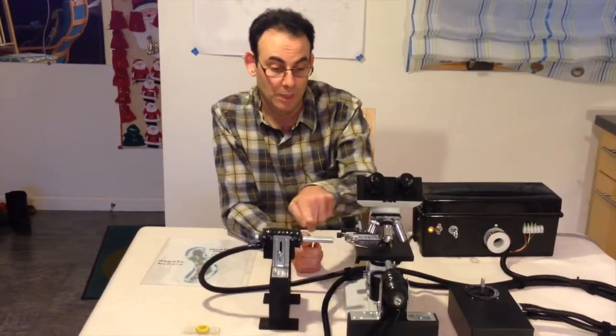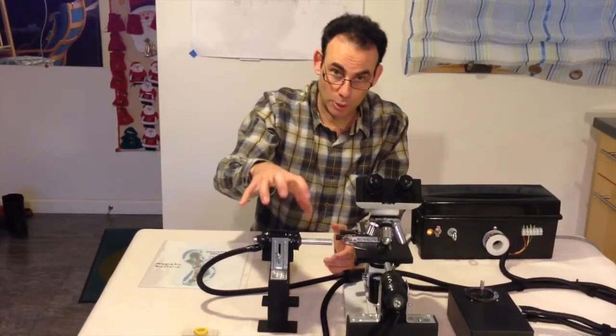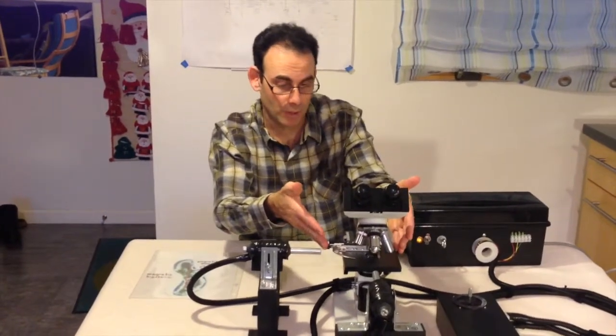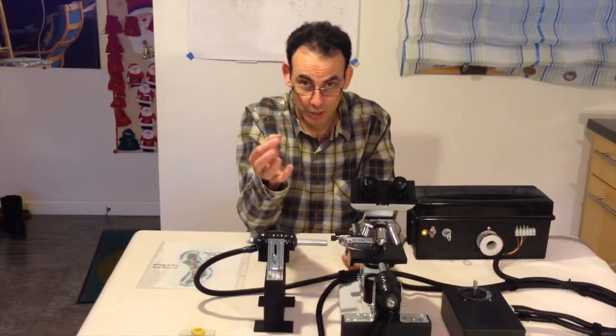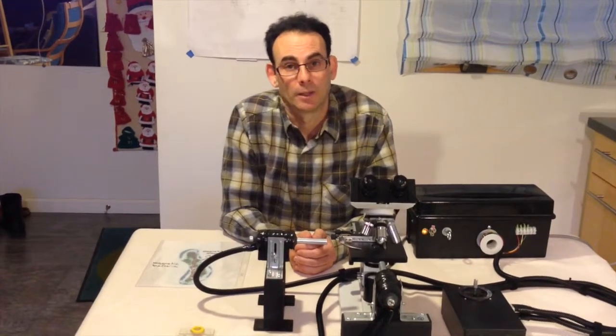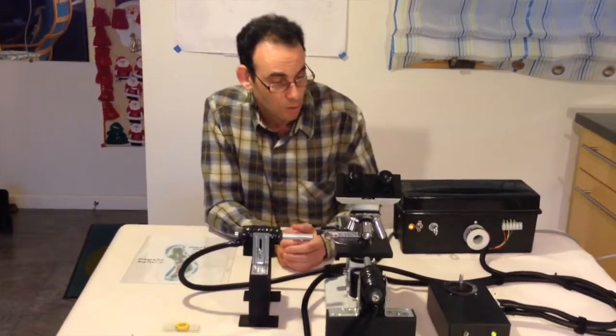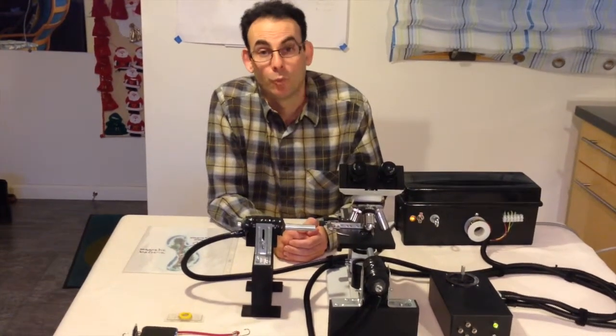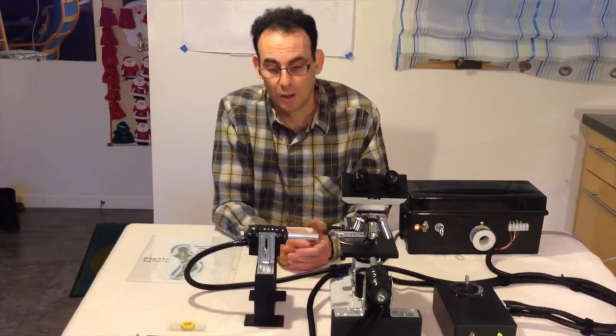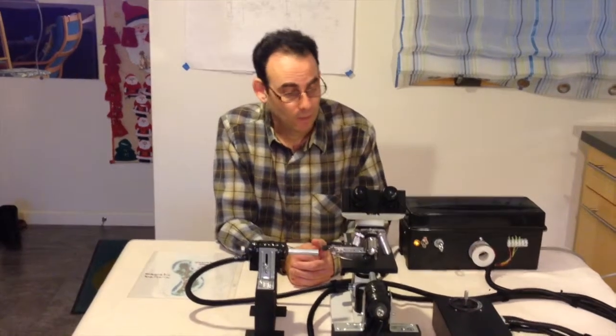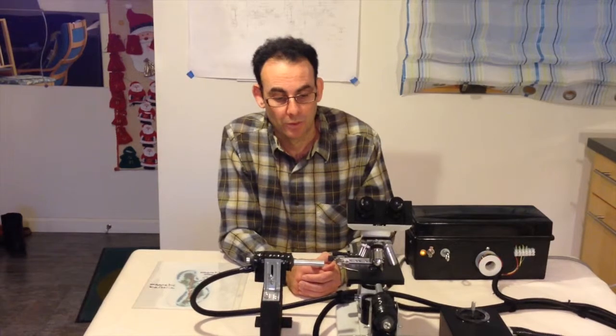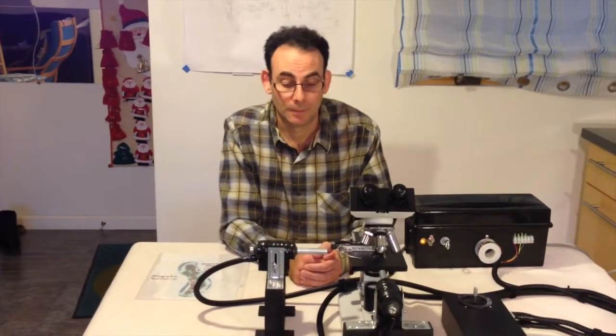That's what made us choose that material. But we needed a long piece so that we could keep our bigger coils off the stage of the microscope. There's not much room there, but as you can see, we can reach in and really create a nice strong magnetic field. These coils we can run off one or two volts. We have many wraps and low current, less than an amp, so it's quite simple to produce the fields you need.